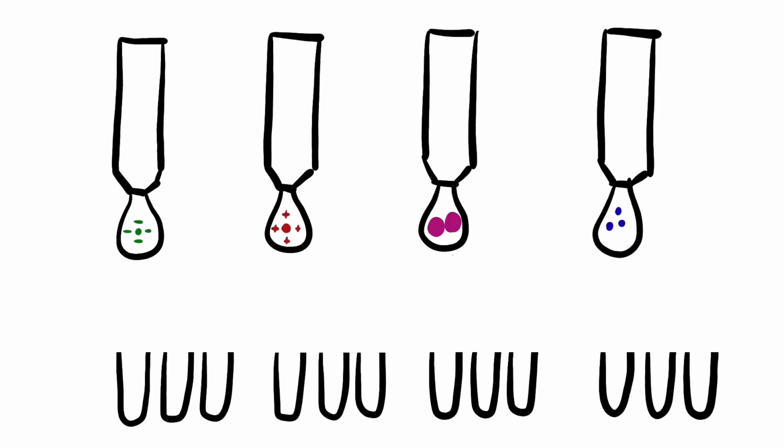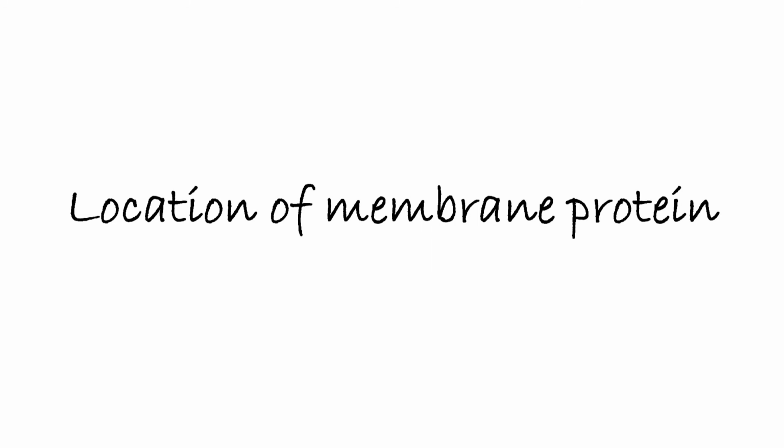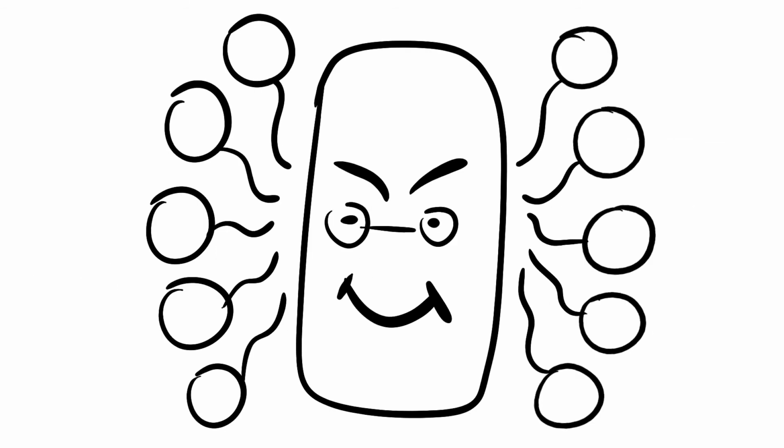And by making use of the chemical and physical characteristics of the membrane protein, we can design efficient purification protocols which separate the membrane protein by its charge and size from other components in the cell. During the whole process, we have to consider that membrane proteins, as the name suggests, are located in the membrane. The membrane is a phospholipid bilayer. This means membrane proteins require detergents, which mimic the cell membrane to keep the protein happy in its new environment in solution.